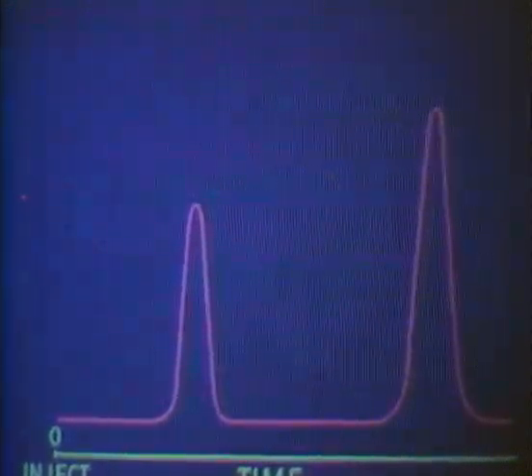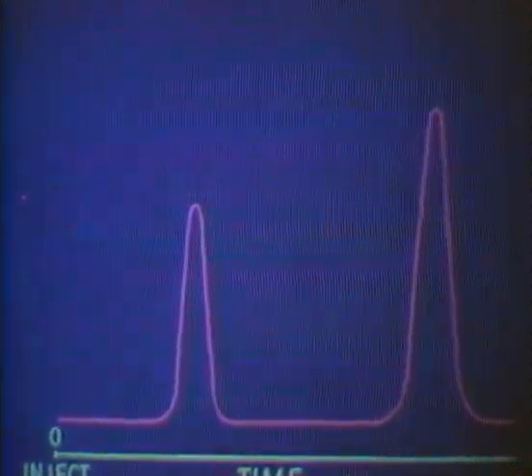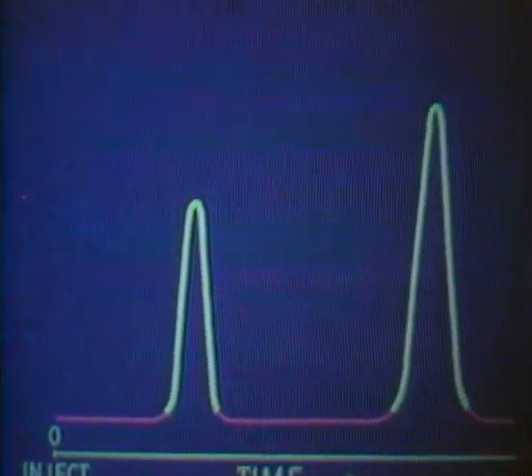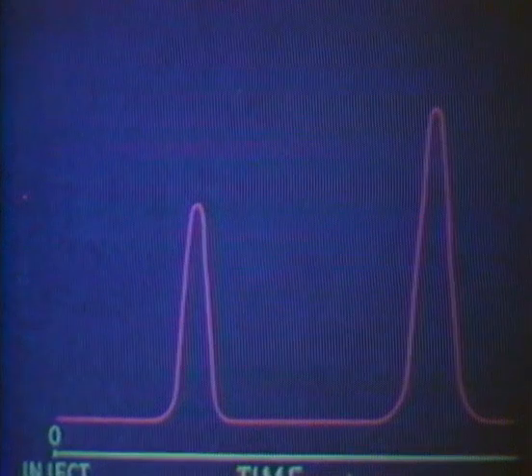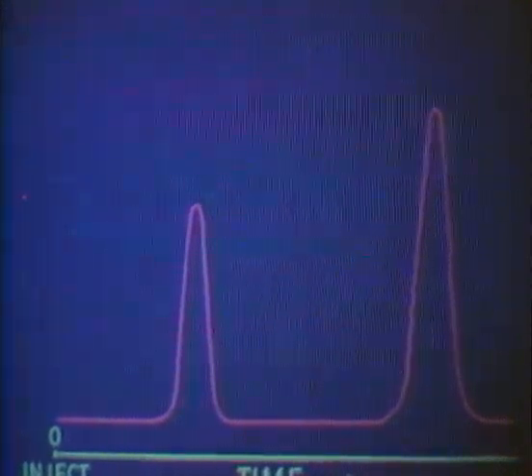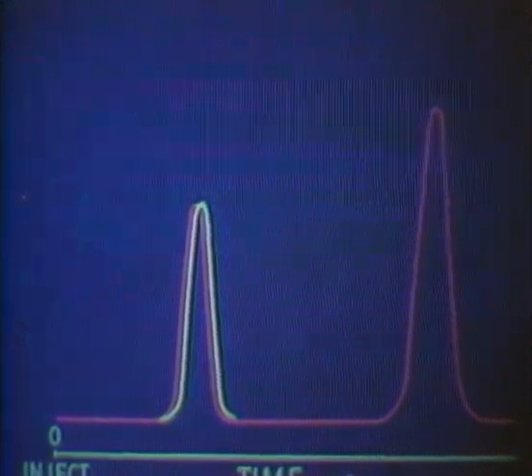Each peak corresponds to a component separated in the column. The peak takes the familiar bell shape of a Gaussian distribution curve, if the conditions were selected correctly. In case of insufficient separation in the column, one peak may correspond to 2 or even more sample components.